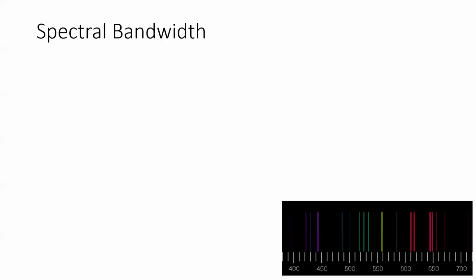And so the realistic line width of these transitions is anywhere from 10 femtometers to around 50 picometers.